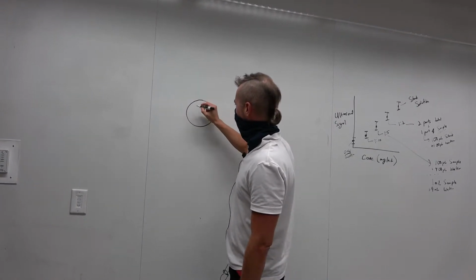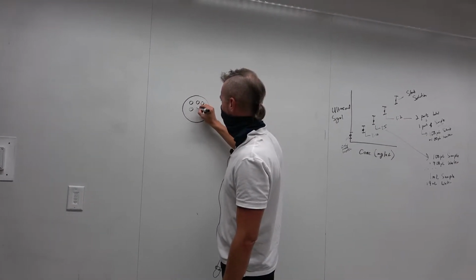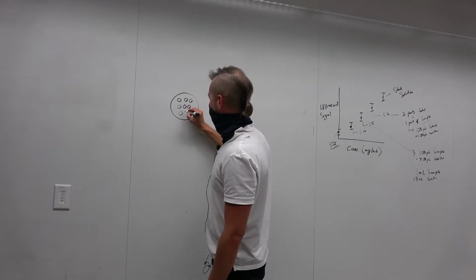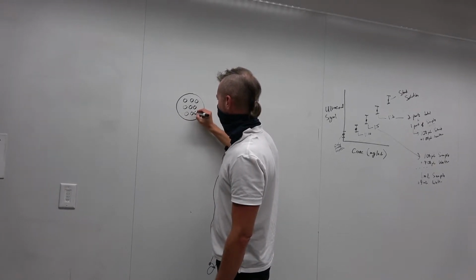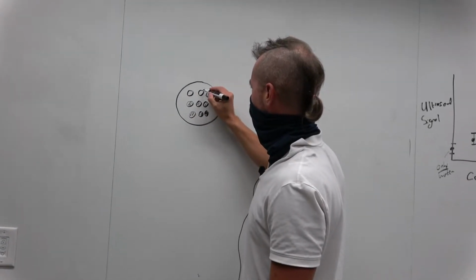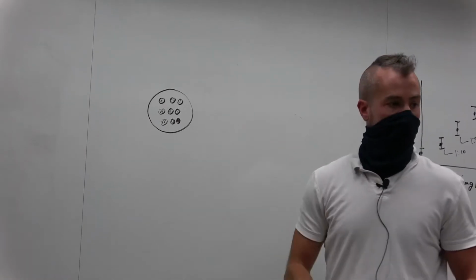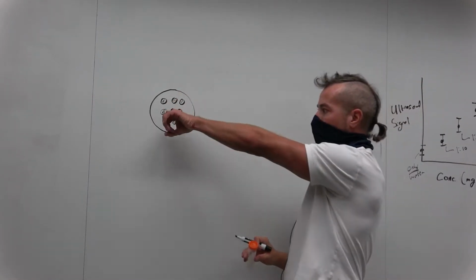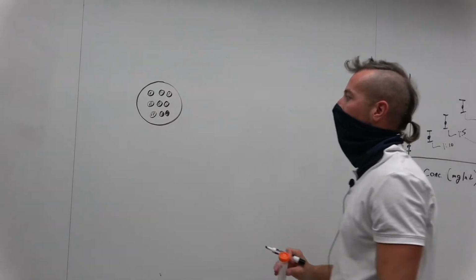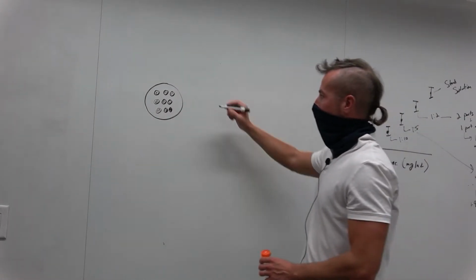You'll see this pretty quickly, and I showed you this in the intro lecture, where your samples are going to be in here. So these are your different samples, and you're going to take your ultrasound transducer and put it on the sample and image it.